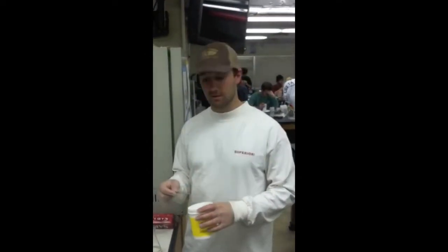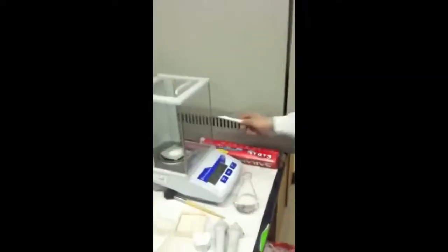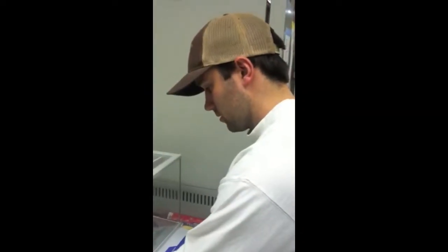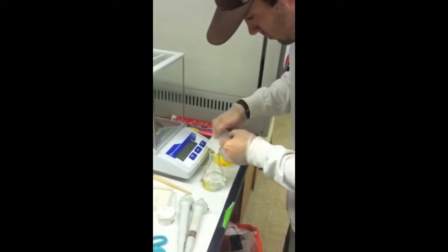Next, you're going to weigh out 1.0 grams of agarose, and then pour it into your 125 mL solution from the previous step, and then swirl it together.